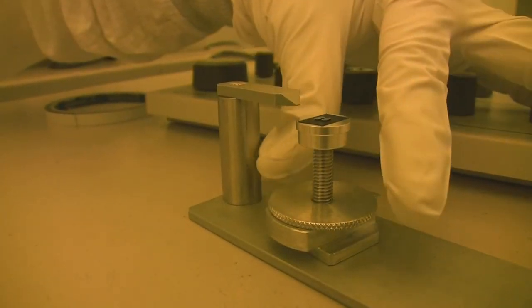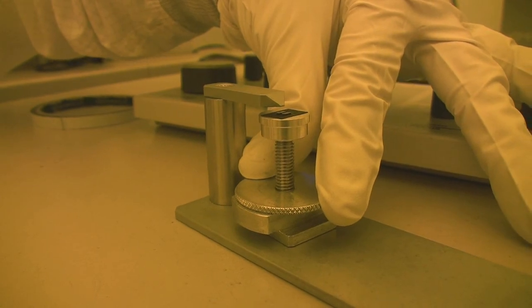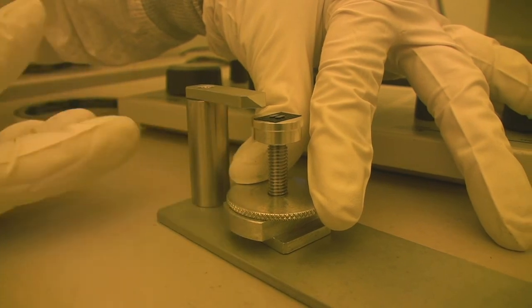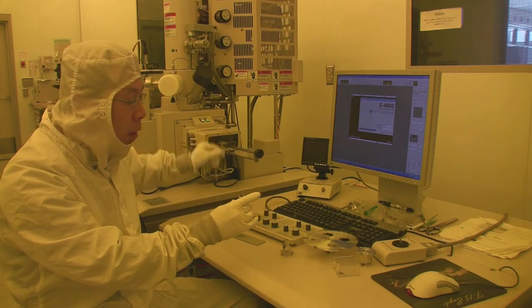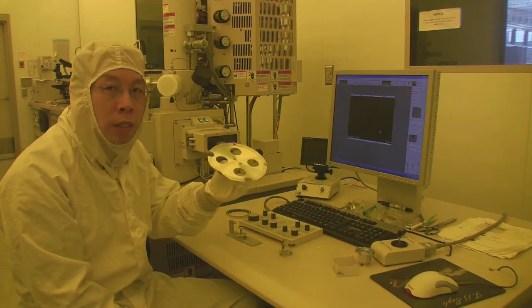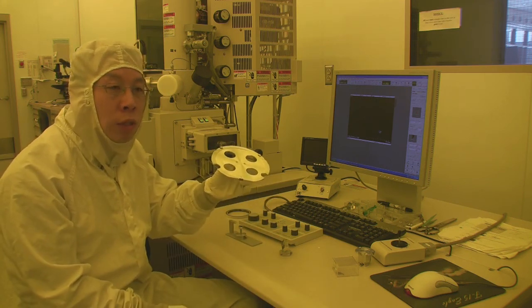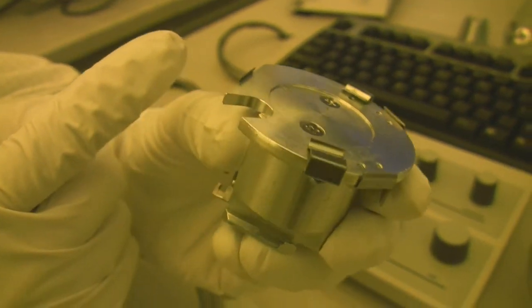We want to set the sample holder with the sample underneath this standard height. This is the highest you want to go, otherwise your sample will hit the opening of the load lock door. We have different kinds of sample holders, up to 6 inch. This is a sample holder for a 6 inch sample, and this is a 2 inch sample holder.